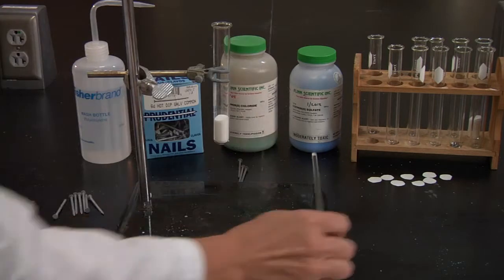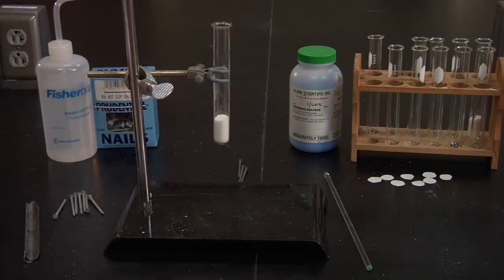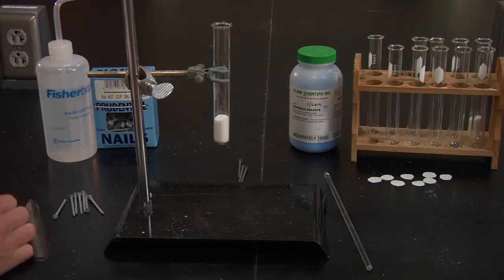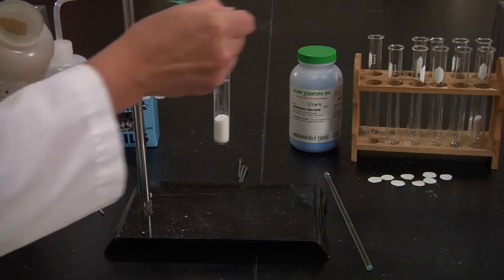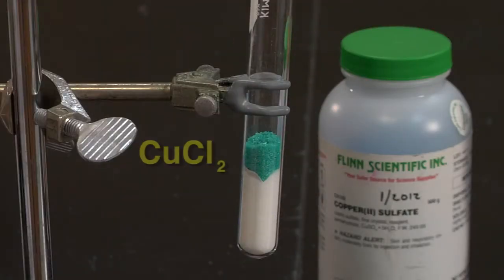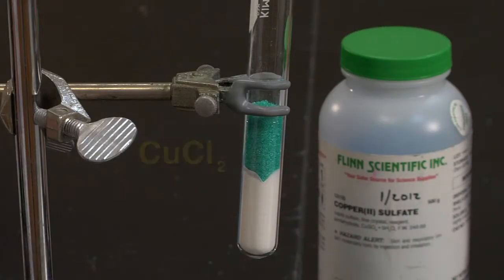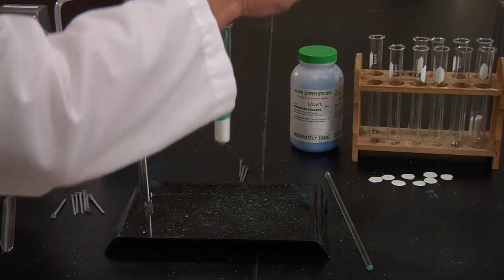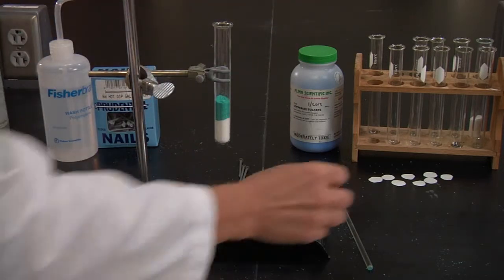Then I'm going to take copper chloride, and I'm going to put about the same amount of copper chloride as sodium chloride. We're going to take another piece of filter paper and put it over the top of that.